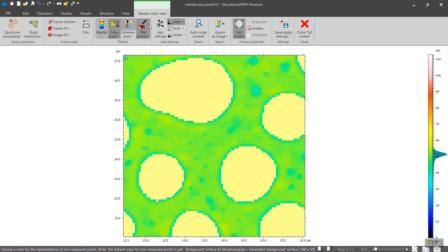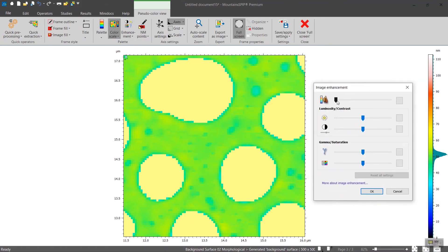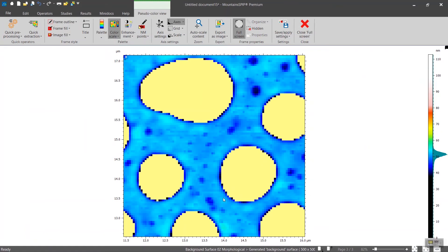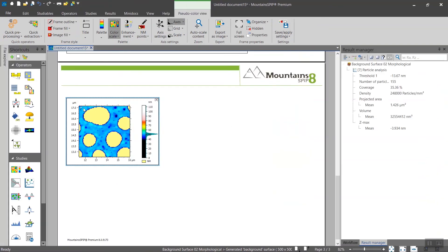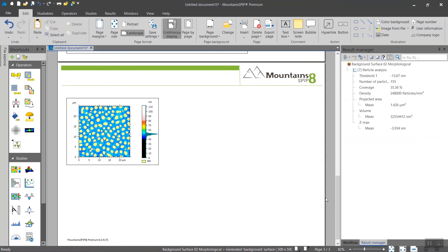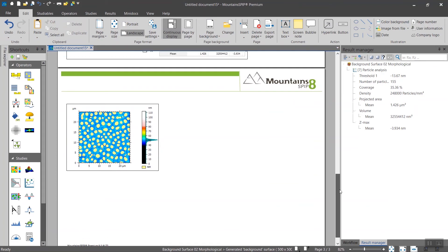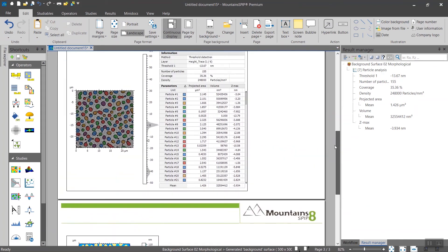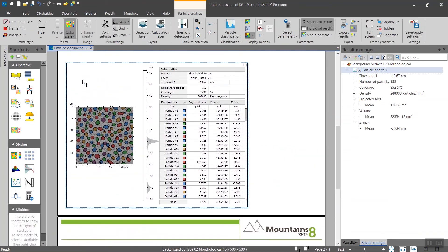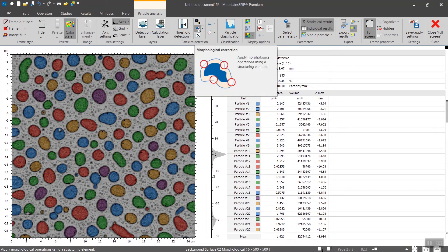If we enhance the palette a bit, you will see that you still have some edge effects. So you could use the retouch operator once more, but here's another way. If we go back to the particle study, there's a feature here that we haven't touched yet which is called the morphological correction.